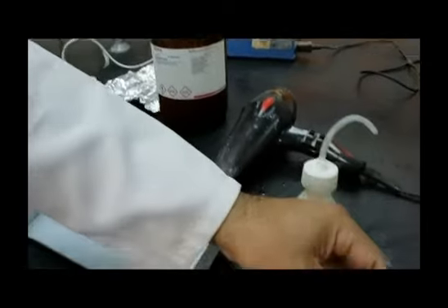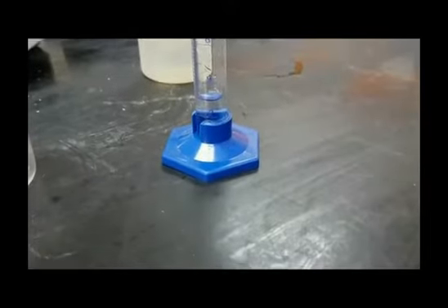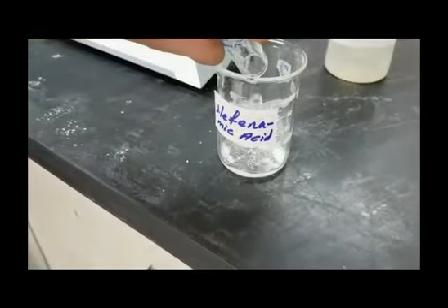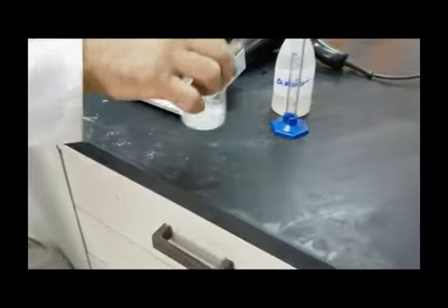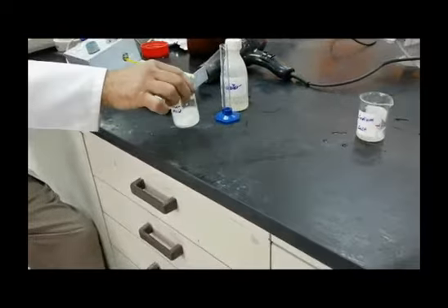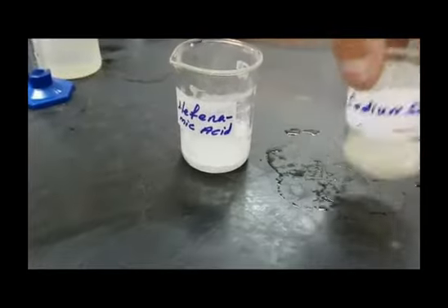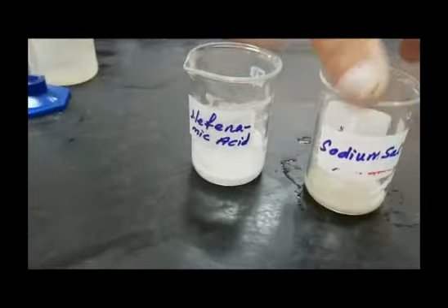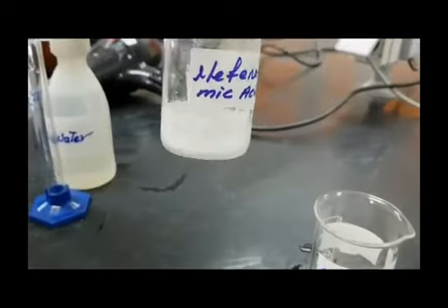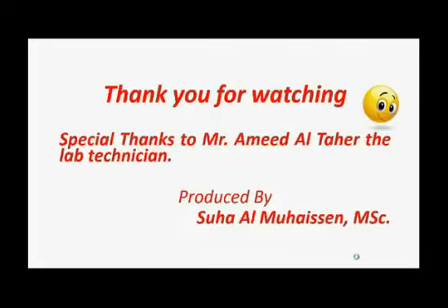After shaking and mixing, you will find that sodium mefenamate is soluble in water, which means its solubility is at least 10%. Then the salt solubility is more than 10 gram percent, while you will find that the acid is insoluble. Consequently, its solubility is less than 3.33 gram percent.